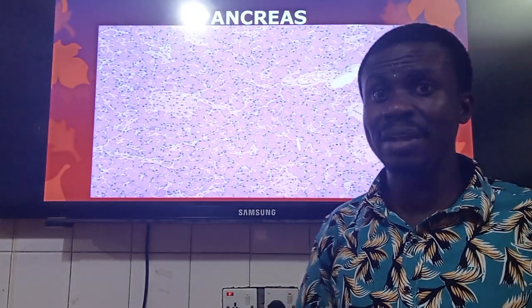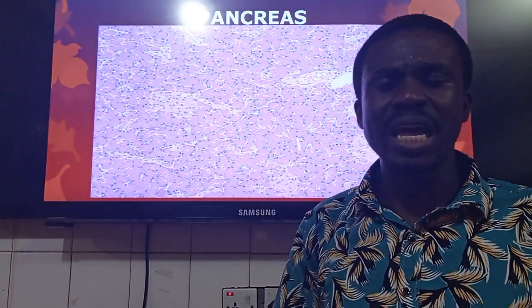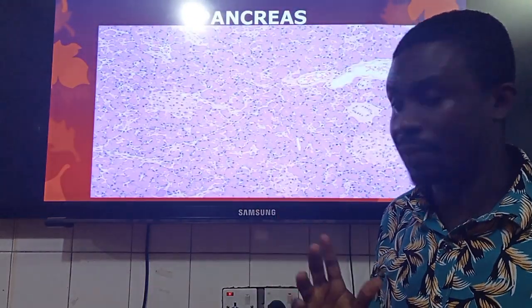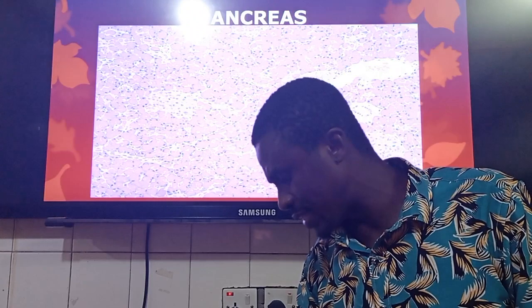And one thing that we know about this is that we have some cells, especially towards the central point. We're talking about the beta cells especially in the central region, and at the periphery we're talking mainly about the alpha and delta cells. I've done these videos already. Please kindly get videos on them and watch them. So that is the pancreas. I want you to appreciate that.